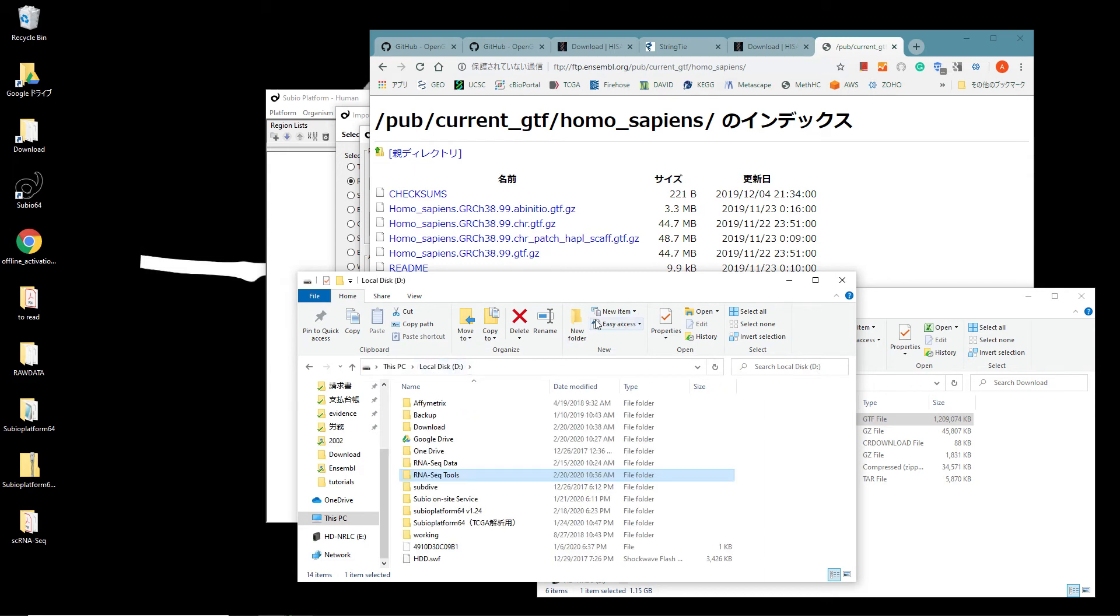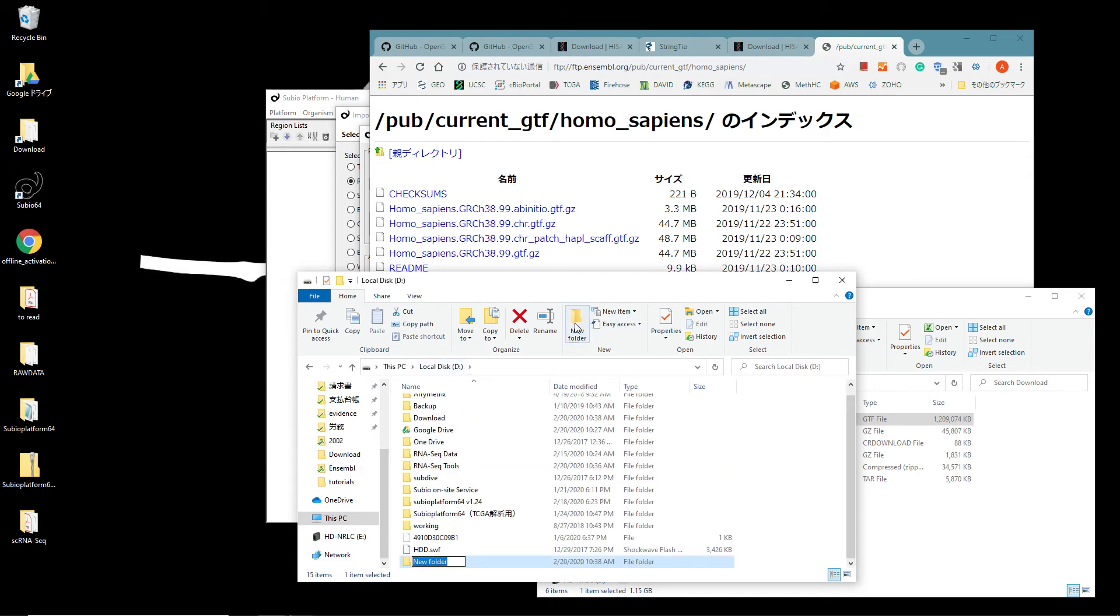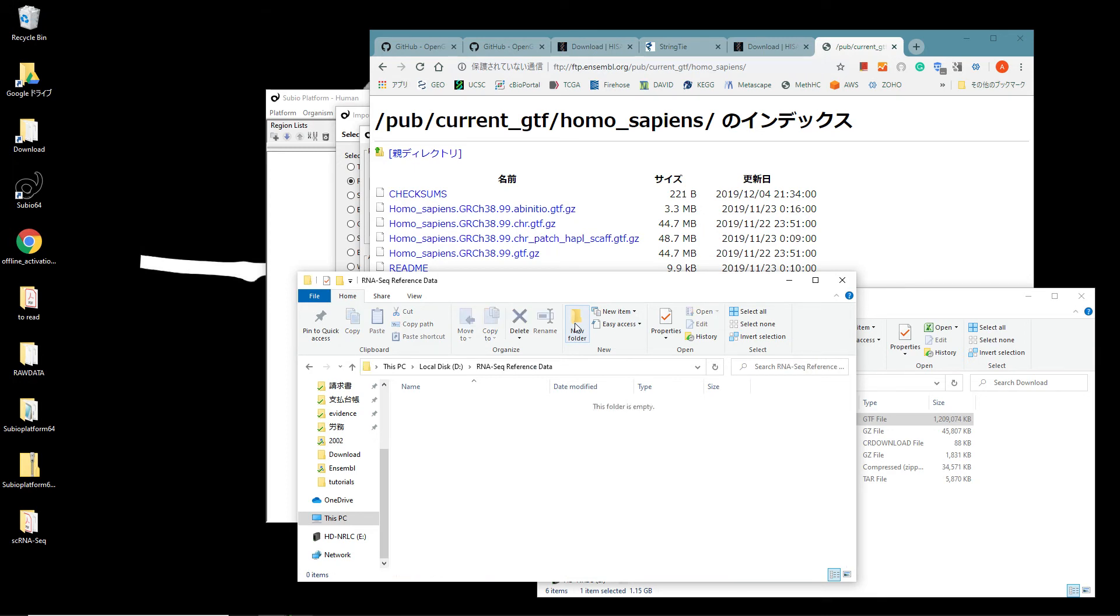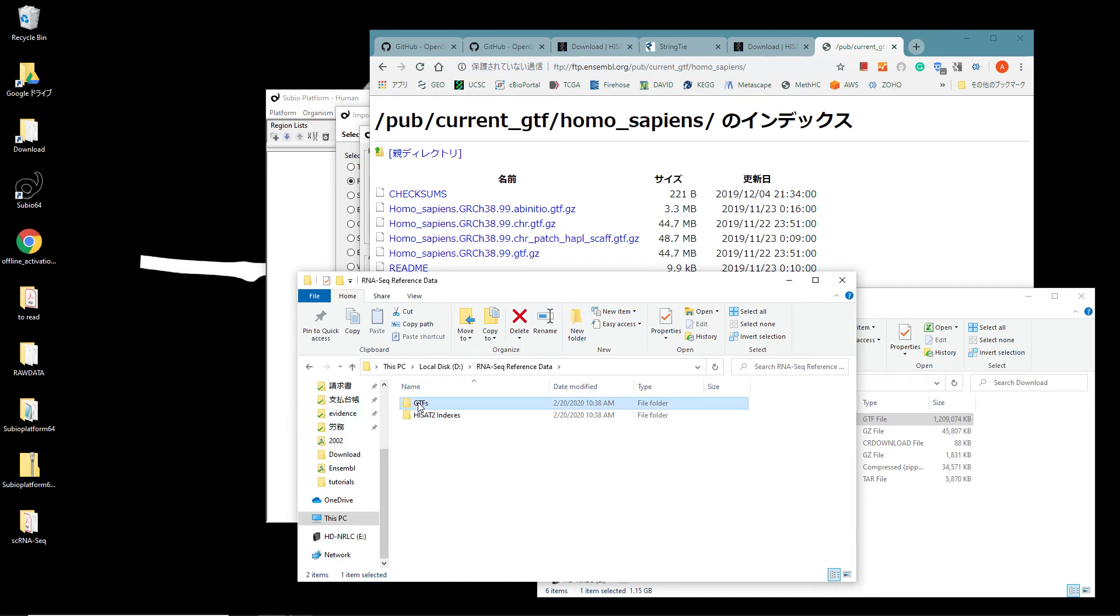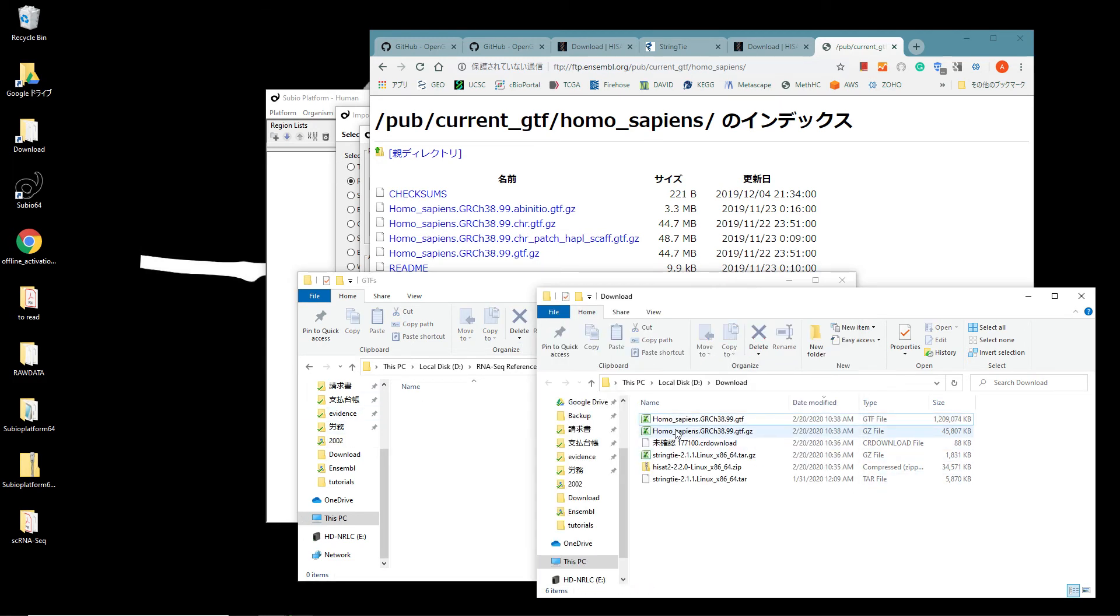You'd create a new folder named RNA-Seq Reference Data under an arbitrary directory, and then create the GTF's folder and the HISAT2 indexes folder. Move the .gtf file that you extracted under the GTF's folder.